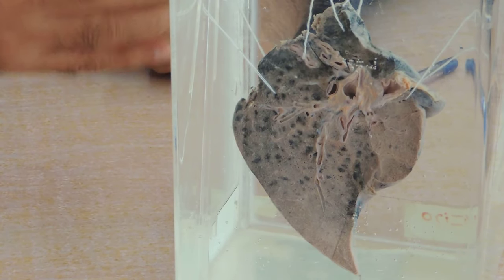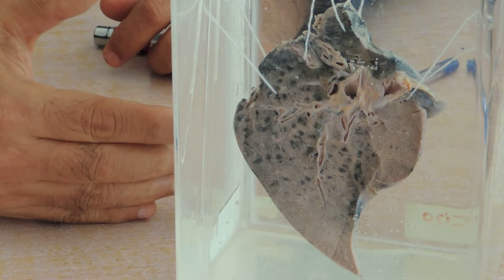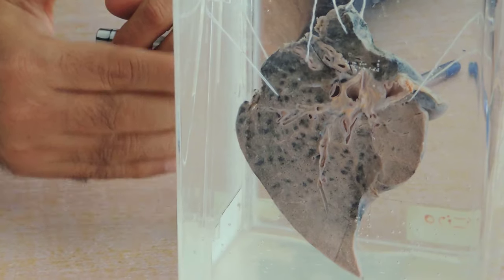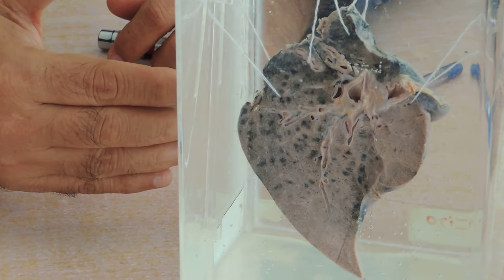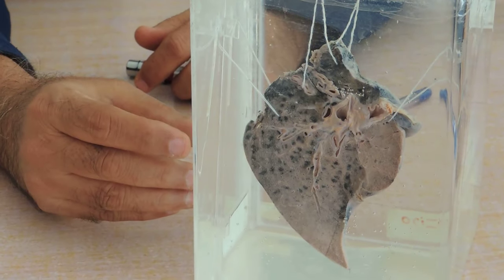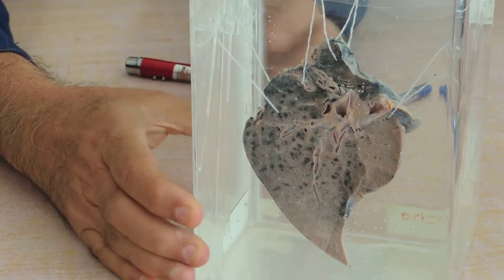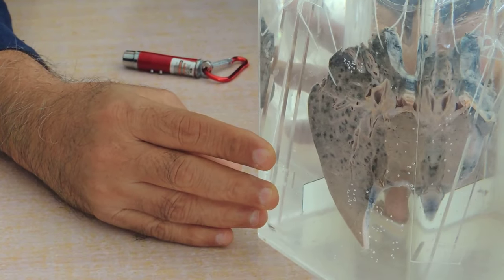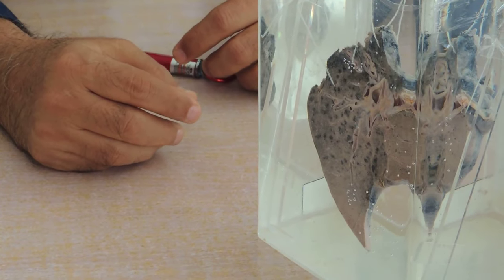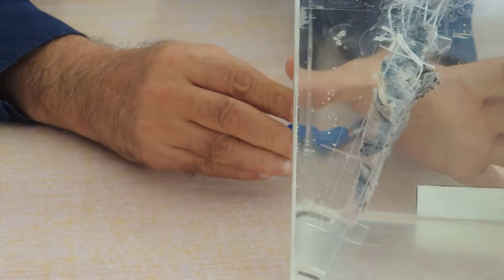So solidification of the lower lobe means it is a case of lobar pneumonia. In viva, don't say whether it is hard or soft or cystic, because you are not touching the specimen. So this is a case of lobar pneumonia. In other cases you can see whether the pleural surface is showing evidence of pleurisy in the form of thickening of the pleura. In this case it is not seen because of the acute process.